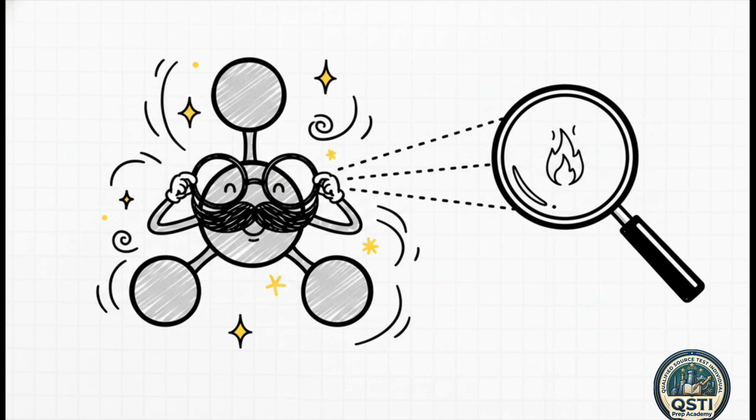Now, here's where the chemistry gets really cool. You might be wondering, why do we even need that reduction catalyst? Well, it's because the Flame Ionization Detector is specifically designed to measure hydrocarbons, like methane. It actually cannot see carbon monoxide directly. No way, right? So our reduction catalyst performs this brilliant little chemical magic trick. It converts the isolated carbon monoxide into methane, CH4. By throwing this chemical disguise onto our sample, the FID can now accurately detect and quantify it. It's just a fantastic scientific workaround.